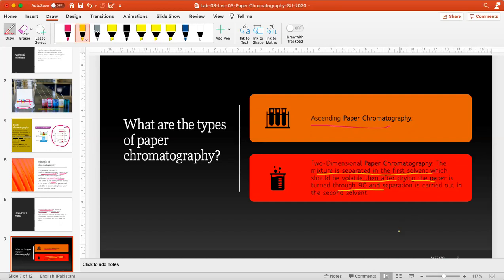paper chromatography means कि अगर हमने एक पेपर क्रोमेटोग्राफी जो है वो इस तरह की है, ठीक है, तो दूसरी जो है आपका जो ये आपका पेपर है, ओके, दिस इज योर पेपर, ठीक है. सो सेकंड हम ऐसे कर लेंगे पेपर को, चेंज कर देंगे उसकी डायरेक्शन. सो टू डायमेंशनल लेते हैं इसको, so that we can have the maximum separation of the mixture.